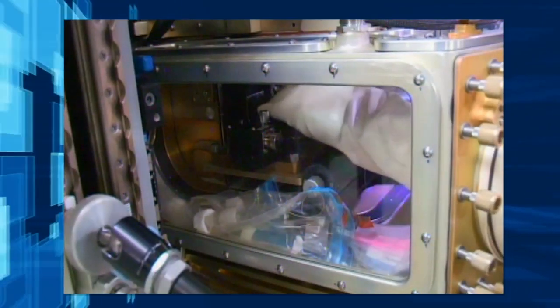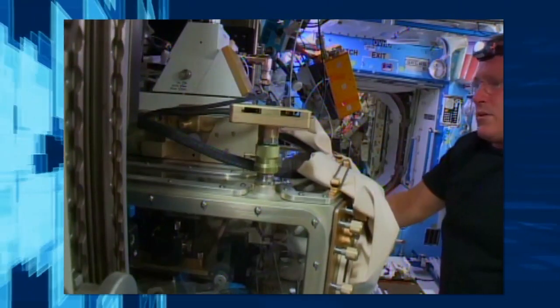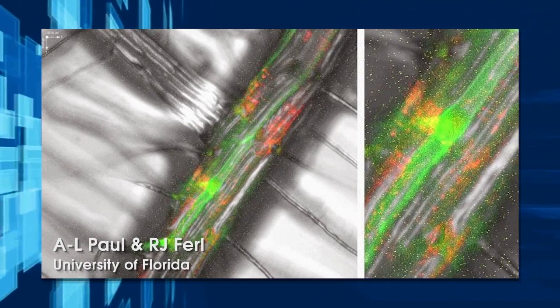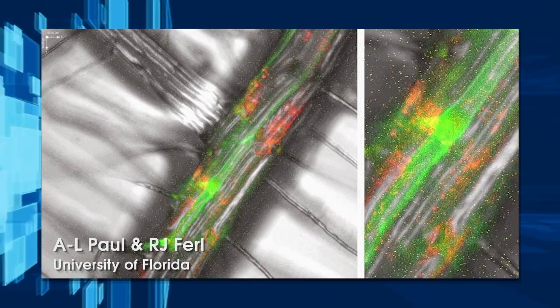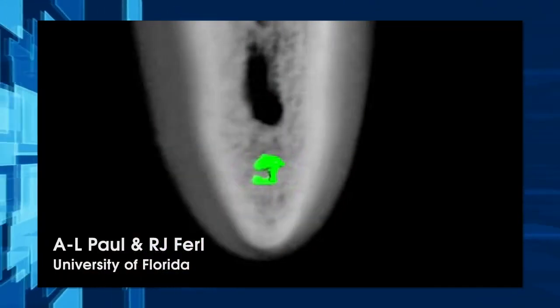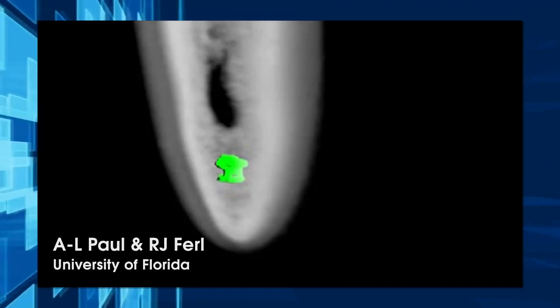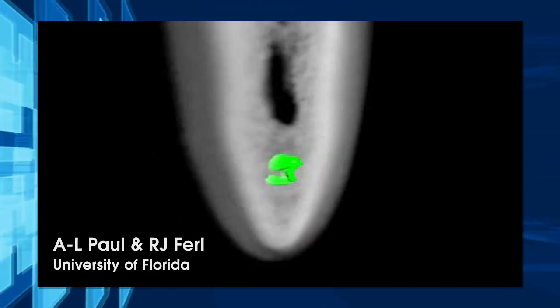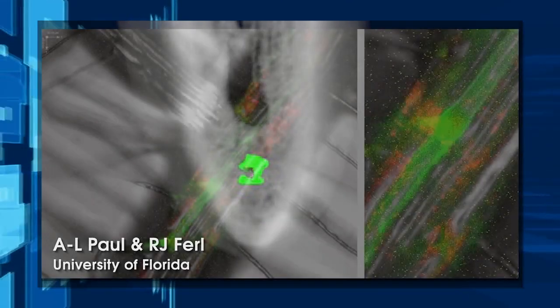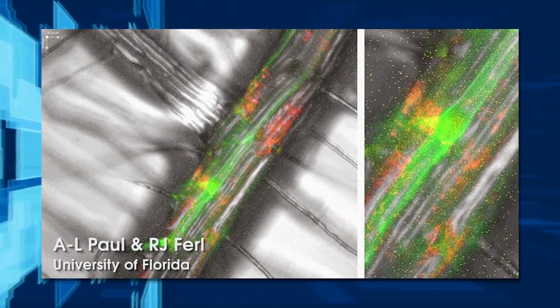But what the LMM allows us to do is take things a little step further. We can now look at individual roots, not only at the macro level, but at the microscopic level. And not just on the surface of those roots, but we can tunnel in by taking different focal planes of the same root and look deep inside the root tip to see which cells are expressing some of the green fluorescent protein genes in which we're interested. That gives us a whole new dynamic to ask how plants are responding and where those cells are changing inside those roots, and a much more dynamic range of gene expression patterns on orbit than we were able to get before.